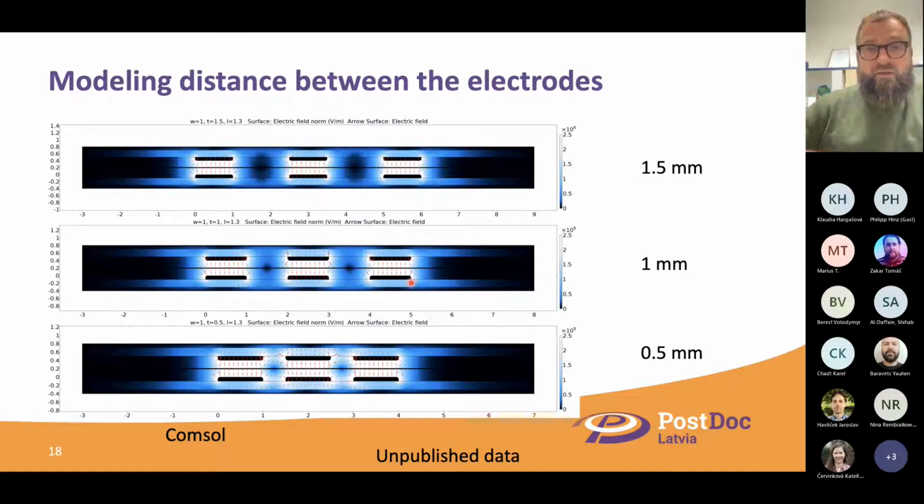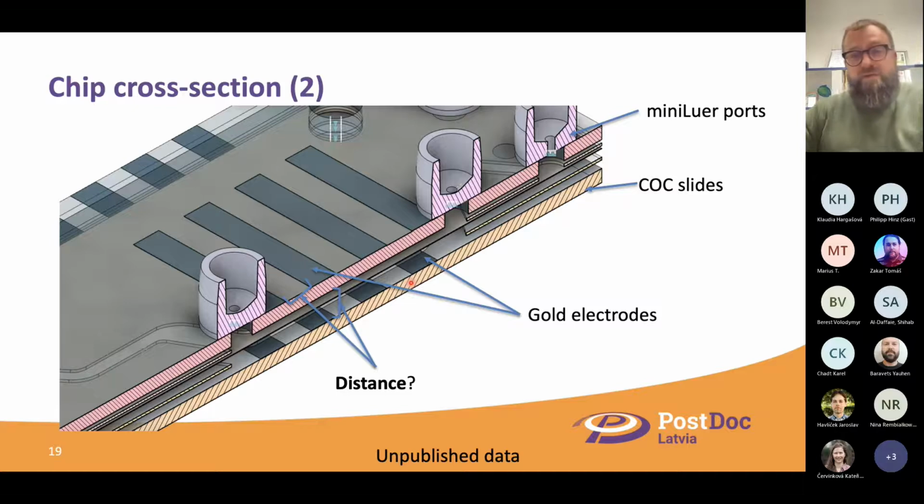For that, we need to model, or have some understanding of, how the electric field distribution inside the channel looks, because it depends on the distance between the electrodes and the distance between the two COC slides.